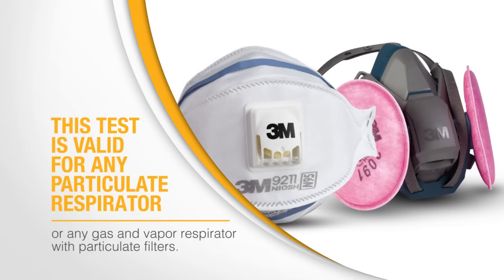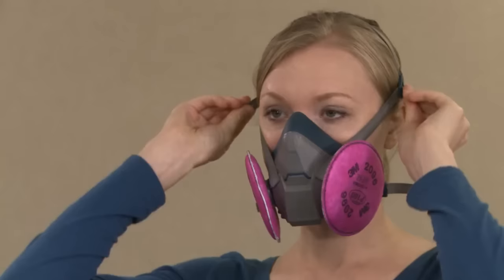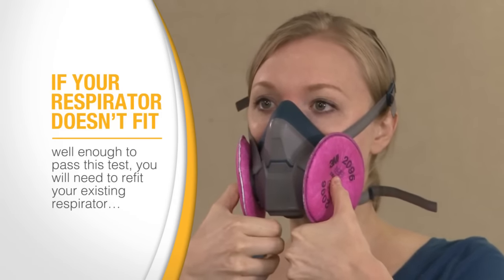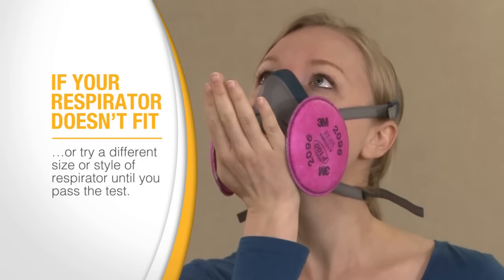The particulate filters are used so that only facepiece fit is tested. The qualitative fit test must be repeated at least once a year to ensure that your respirator continues to fit properly. If your respirator doesn't fit well enough to pass this test, you will need to re-fit your existing respirator or try a different size or style of respirator until you pass the test.